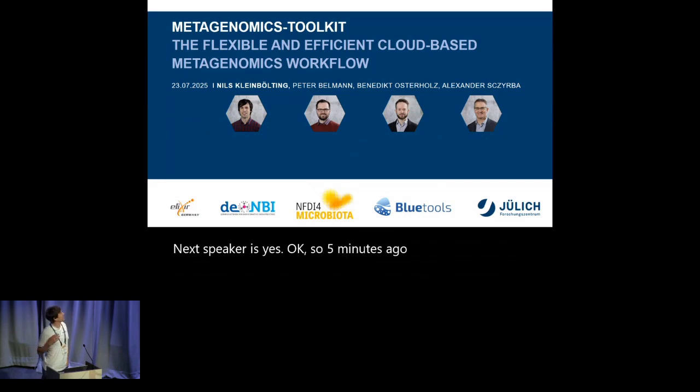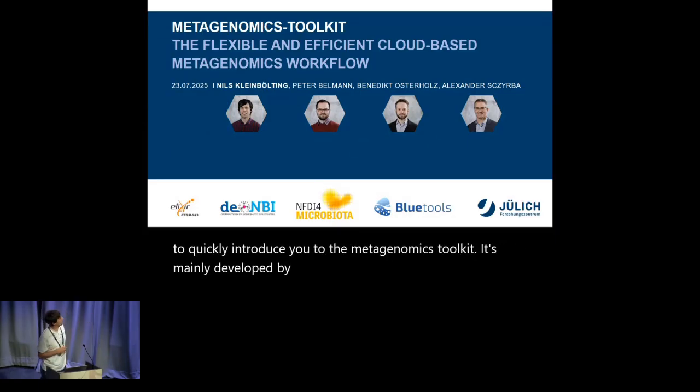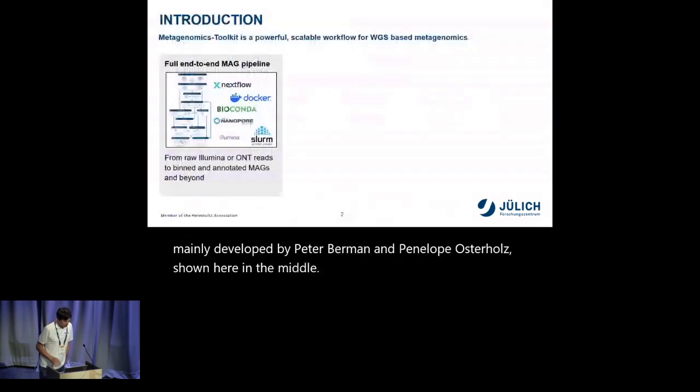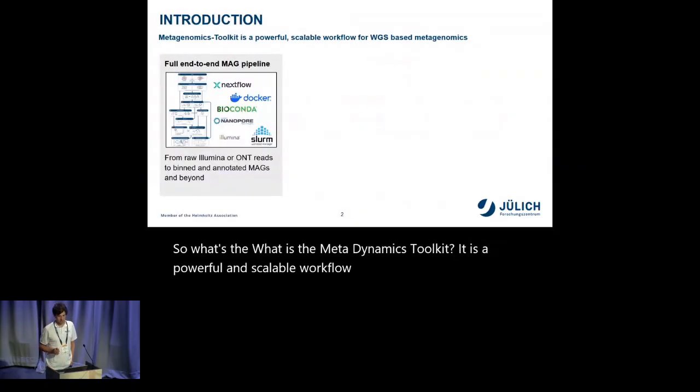Yeah, I would like to quickly introduce you to the Metagenomics-Toolkit. It's mainly developed by Peter Bellmann and Benedikt Osterholz, shown here in the middle. So what is the Metagenomics-Toolkit? It is a powerful and scalable workflow for whole genome shotgun-based metagenomics.